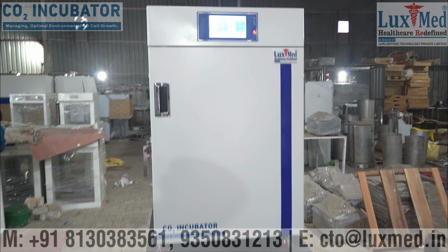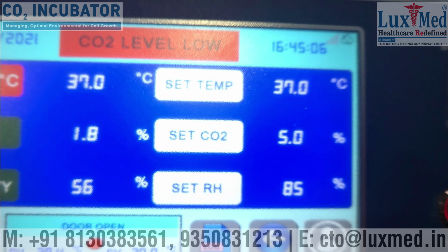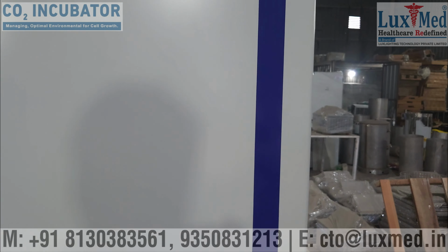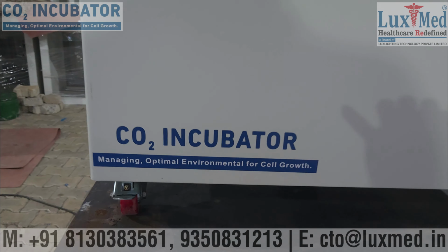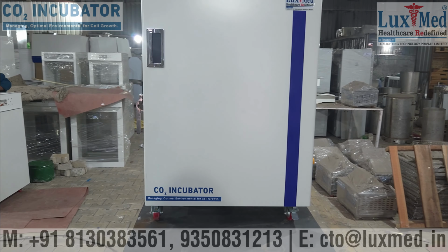CO2 incubators are designed to create and maintain controlled environments for cell culture, primarily focusing on temperature, humidity, and CO2 levels. These incubators use a closed system to regulate the atmosphere inside the chamber, ensuring optimal conditions for cell growth.